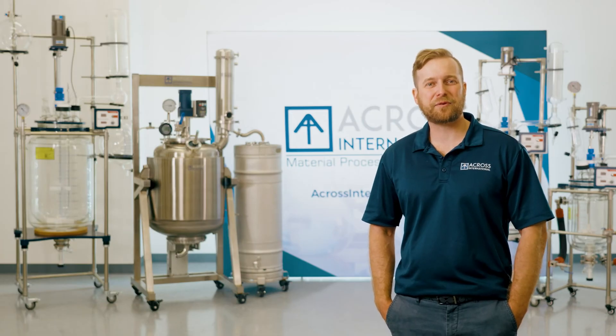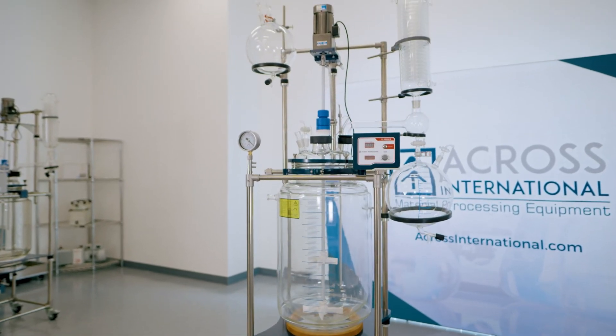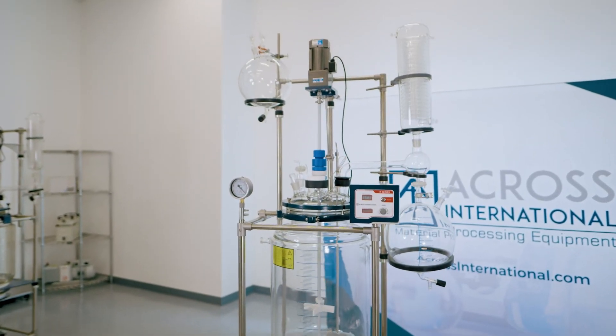Stainless steel and glass reactors are both very popular for these applications, and our filter reactors can also be very useful, depending on the methodology.